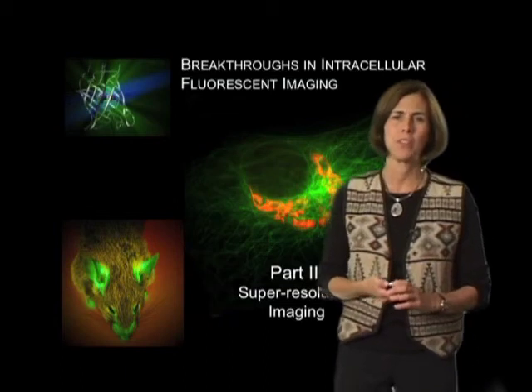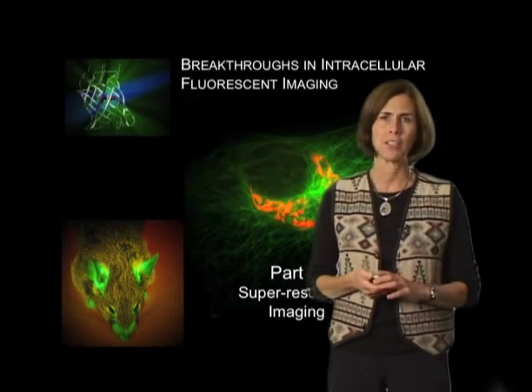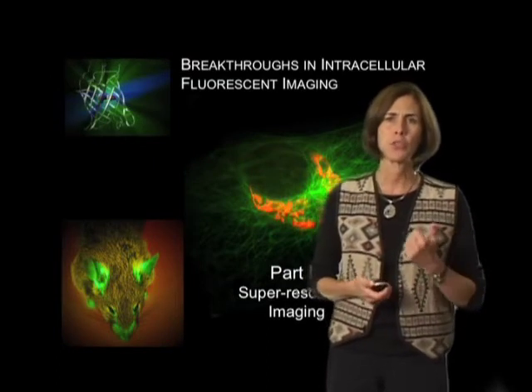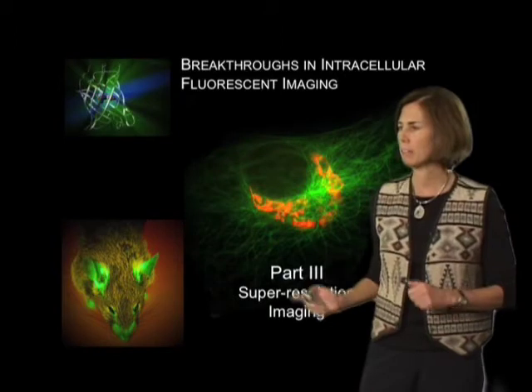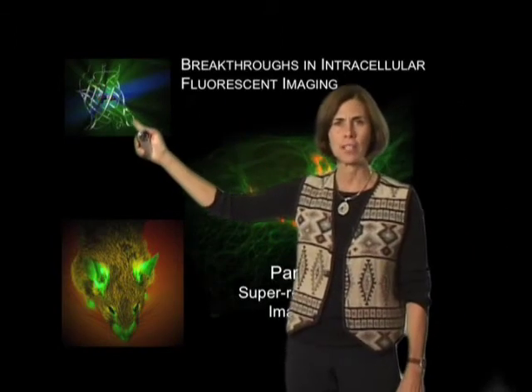So welcome to this seminar series on breakthroughs in fluorescent imaging. In this third section, I'd like to talk about super-resolution imaging using photoactivatable fluorescent proteins.